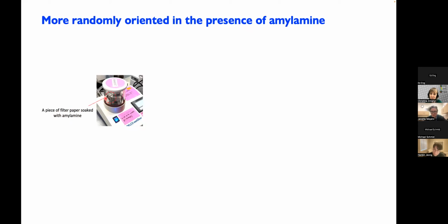We had a comment, I'll add that it was a very interesting way to solve the orientation problem by changing the glow discharge. I agree, it was pretty cool. So mark that one off.